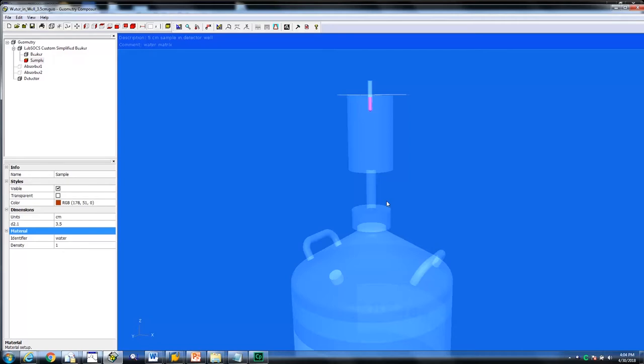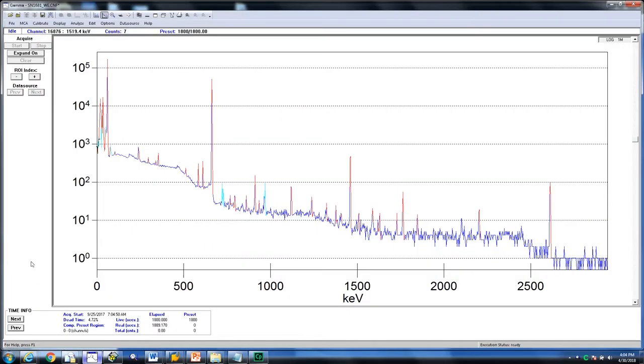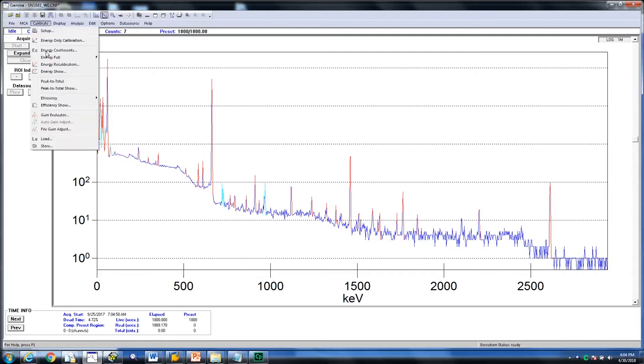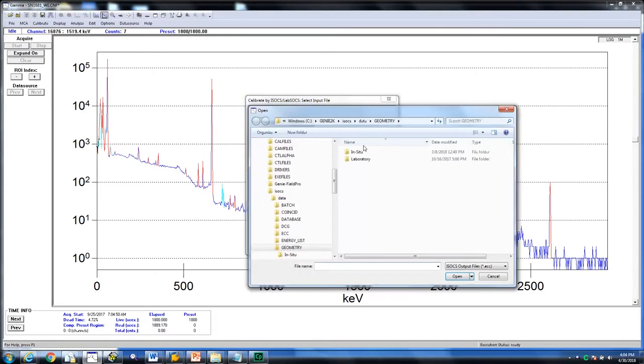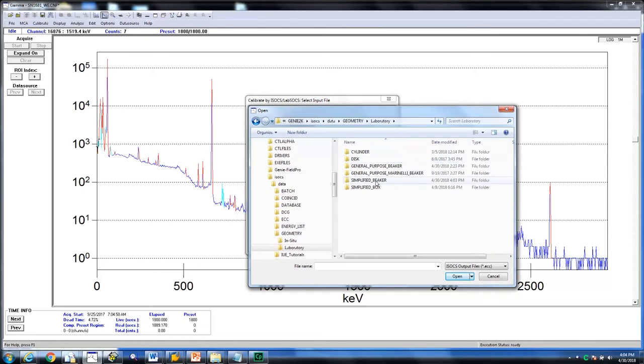Return to the well detector and apply this. Click on calibrate and then efficiency. Select by ISOX and LabSox. Click on select and choose your ECC file that was just created. Then click open.